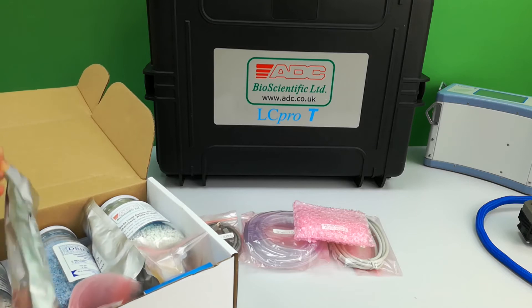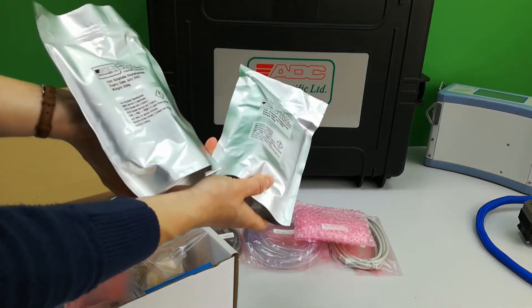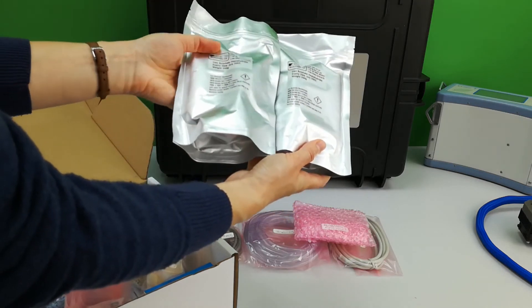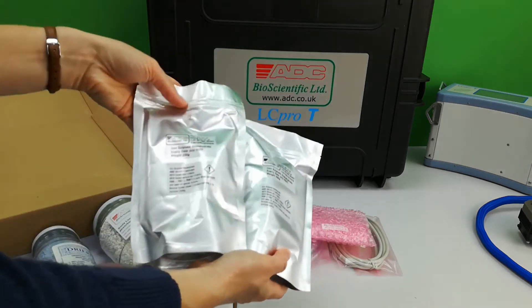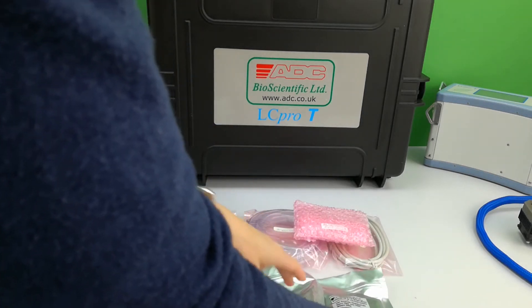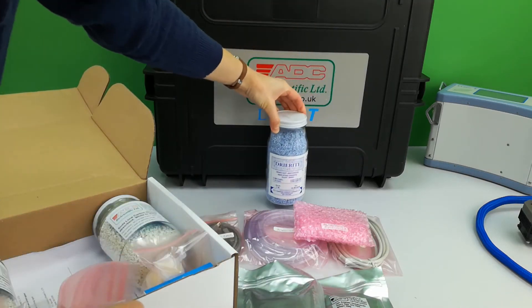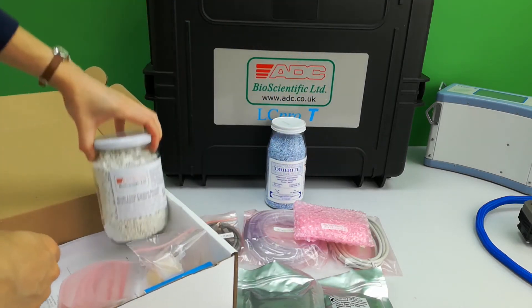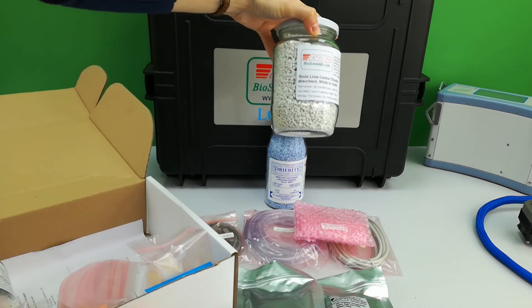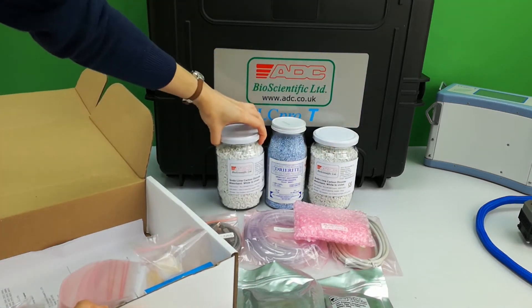Two packets of iron sulphate are provided for wetting the air entering a leaf chamber. A jar of dry right is included for drying the leaf chamber air. Two jars of soda lime are supplied which strip the air of CO2. All safety data is also included.